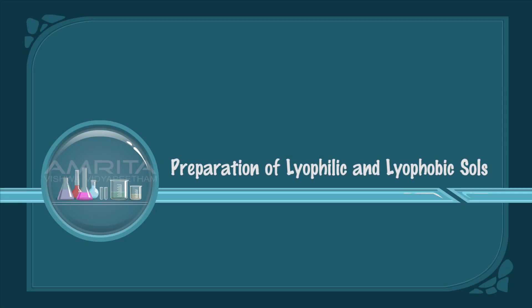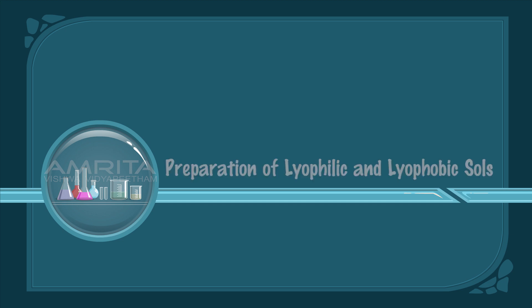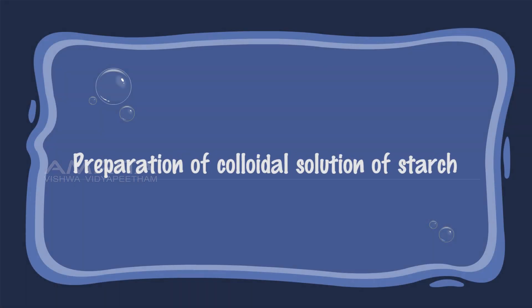Preparation of Lyophilic and Lyophobic Sols. Preparation of Colloidal Solution of Starch.